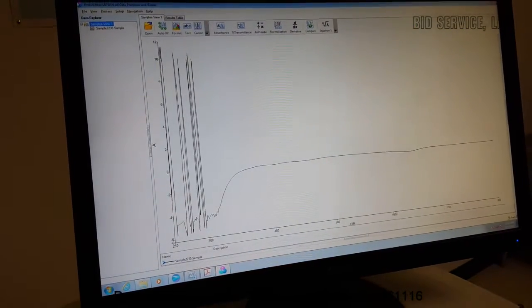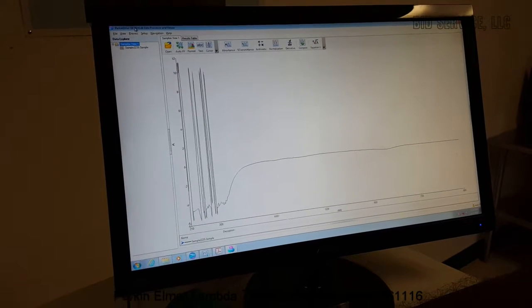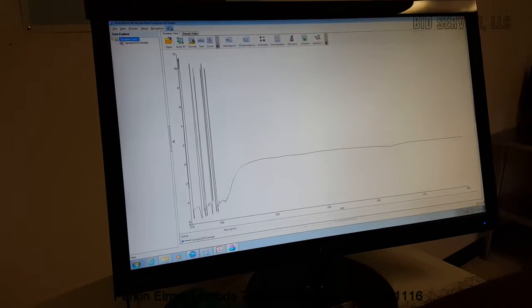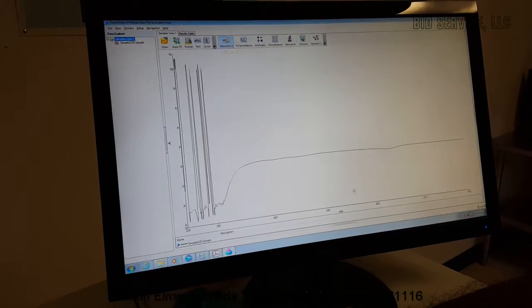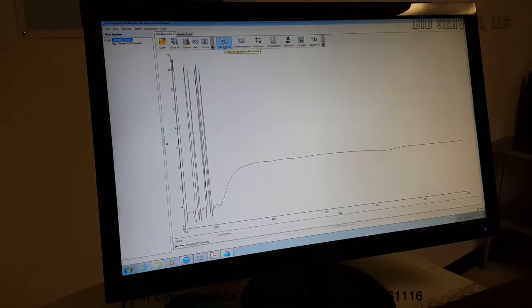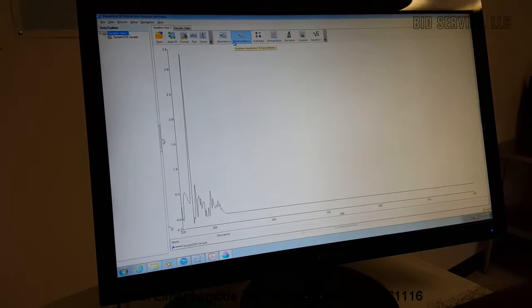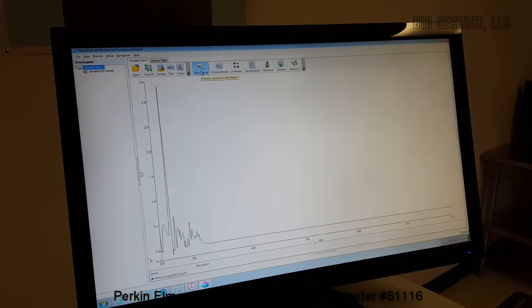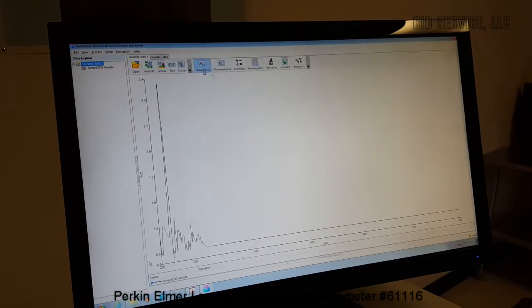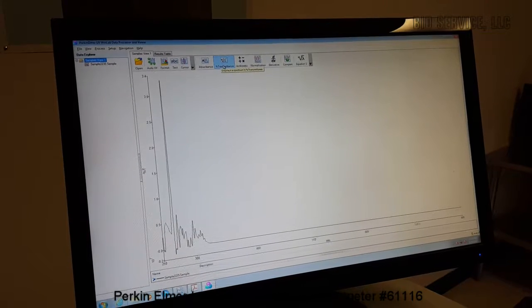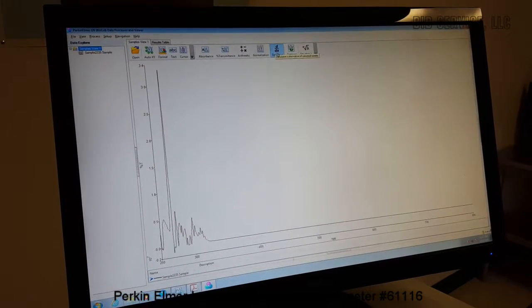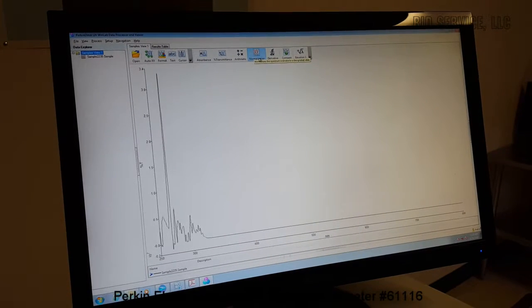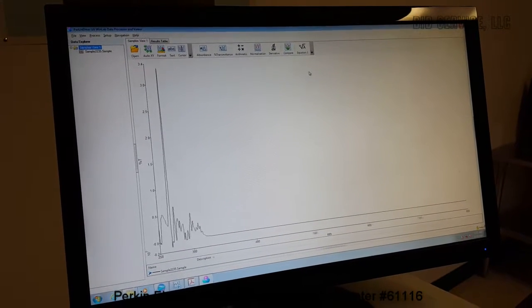There's also an additional window, UV WinLab data processor. And here, the data plot can be processed. For various parameters, either absorption or transmittance parameters can be selected. And a derivative or normalized curves and comparison curves can be plotted.